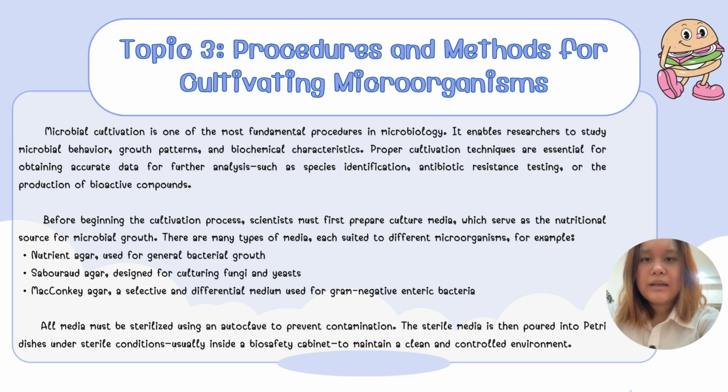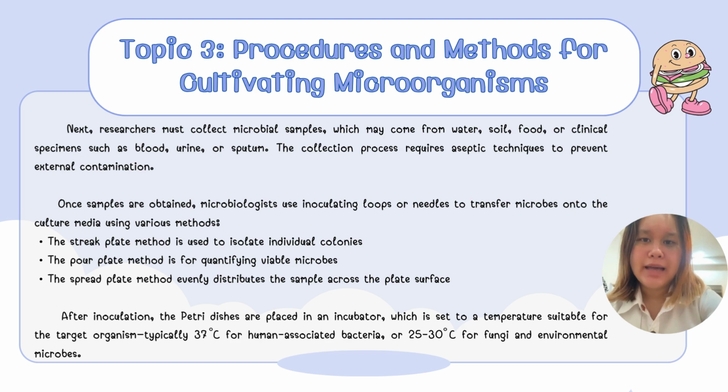The sterile media is then poured into petri dishes under sterile conditions, usually inside a biosafety cabinet, to maintain a clean and controlled environment. Next, researchers must collect microbial samples, which may come from water, soil, food, or clinical specimens such as blood, urine, or sputum.